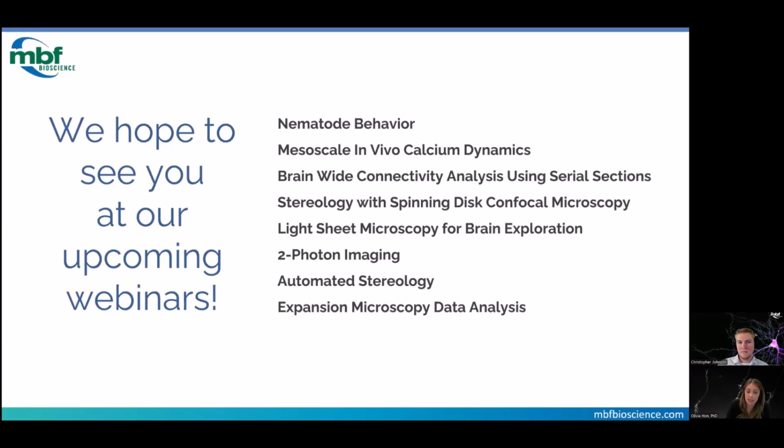With the difference in isosbestic point, that's a little bit more tricky. Because often the isosbestic point for most sensors isn't published, and so we don't have a lot of great information. But there are other ways that you can do controls to correct for photobleaching. If you're doing an experiment where maybe you're co-injecting a tdTomato or an mCherry just as a static indicator, you can use that channel as your baseline signal. You don't necessarily have to use the 415. And so that would be one way to get around the isosbestic if you have a sensor where there's a lot of overlap in the 415 and the 470.